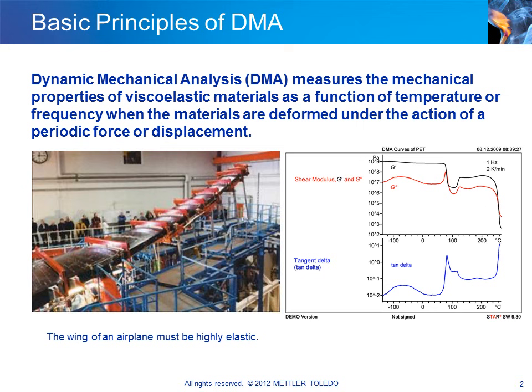Most modern constructional components are in fact subject to a wide range of stresses at different frequencies. DMA measurements can be used to characterize the viscoelastic behavior of materials and measure modulus values. This helps to ensure that suitable materials with the right mechanical properties are used. Depending on the measurement mode, DMA determines either the shear modulus G or Young's modulus E.